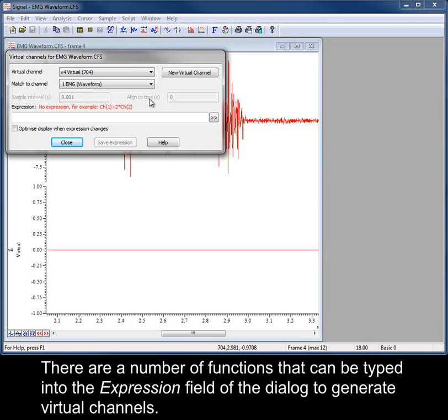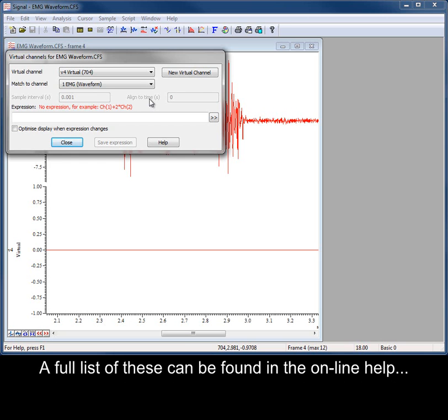There are a number of functions that can be typed into the expression field of the dialog to generate virtual channels. A full list of these can be found in the online help.